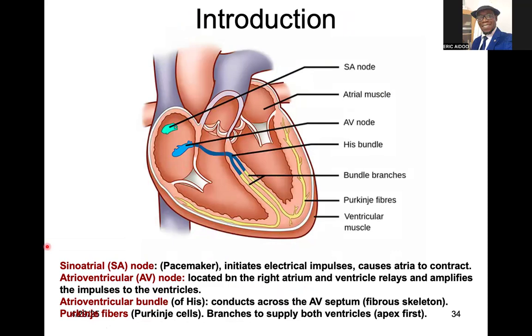So as part of introduction, we want to look at a vertical section through the heart, right from the apex all the way. You can observe the atrium, which is the right portion, the ventricle also right, and then this is the left chamber, so atrium and then ventricle.